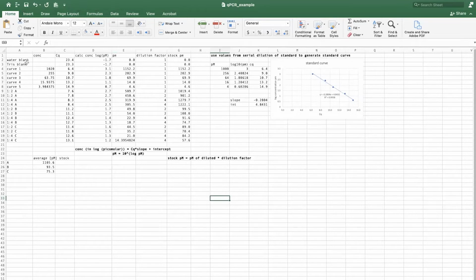What I have over here is my negative controls: I have my water, and I have my Tris, so my buffer. Then this curve is going to be my standard curve. I've done a 1-to-4 serial dilution of this standard curve. Here I only have one replicate in this example, but if I started doing two, it's better to have better data. Especially if one of the points is a little off, you want to have a backup. And then you can just average the values that you get from those curves.